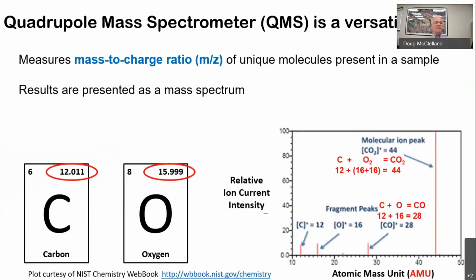So the Quadrupole Mass Spec is a very versatile tool. It provides us a wide range of measurement. Not only one species of gas, but the total composition of gas is measured. And not just at high concentrations, but we go all the way from 100% down in the parts per million measurement. So the mass spec identifies what the composition of your gas sample is.